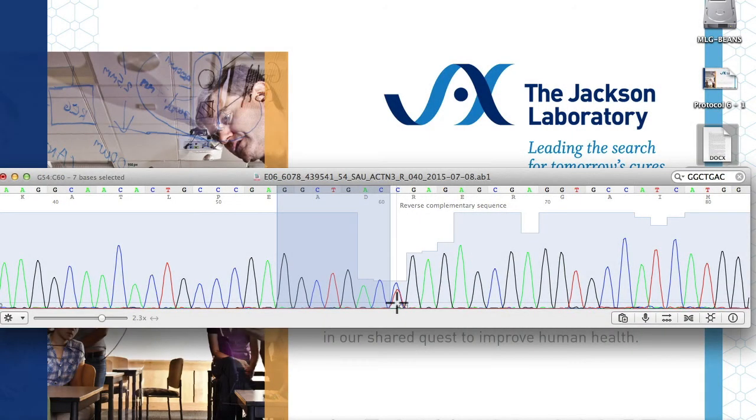We see the same result in the reverse read as we did with the forward read, heterozygous at this SNP location. This process does not provide any additional information in terms of genotype, but simply confirms the information determined by the forward read and is an example of best practices when analyzing sequence data. The reverse read also serves as a backup in case the forward reaction does not sequence properly.